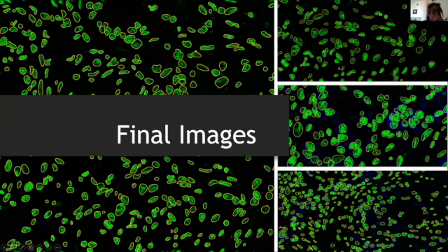So once we go in and fix an entire image, and these images can take anywhere between 3 hours and 8 hours, we produce images like this. And the purpose of this segmentation process is so that the algorithm can give better segmentations to future data sets. So eventually, we don't have to go in and edit these cells or make corrections.